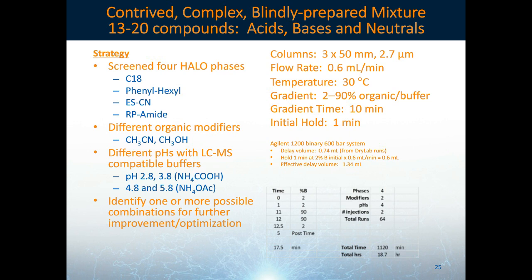And then here at the bottom, you can see our total runtime for each of these screens was 17.5 minutes. So using that in combination with the 4 different bonded phases, 2 organic modifiers, 4 pHs, and 2 injections under each of those conditions gives a total of 64 runs, which was a total time of 18.7 hours. And if you were running these screens overnight, that would take less than a week to get through all the experiments.